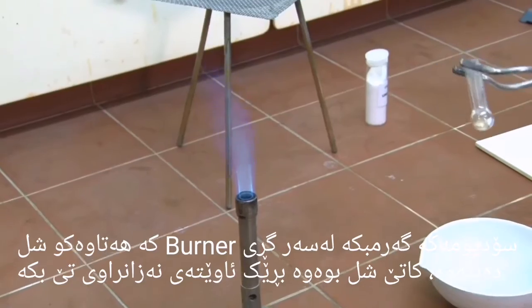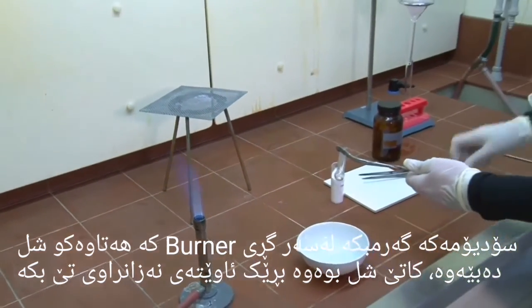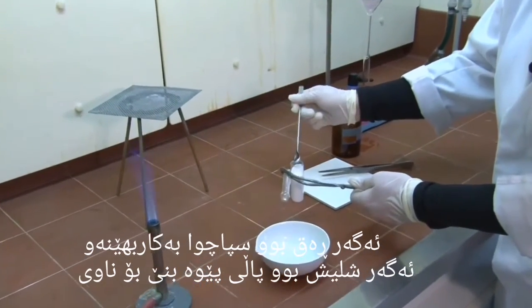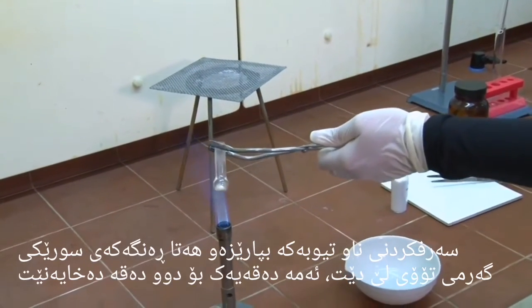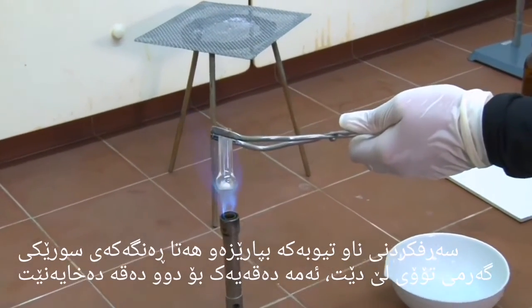When the sodium's melted, add a small amount of your unknown compound. If it's a solid, use a spatula. If it's a liquid, put it in with a pipette. Keep heating the ignition tube until it's red hot. This will probably take 1 to 2 minutes.